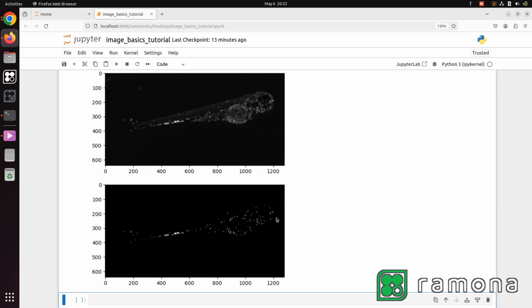Overall, this information is fairly basic but is critical to understanding how to work with image data on computers. In further tutorials, we will build off of these concepts exploring what the MCAM can do.